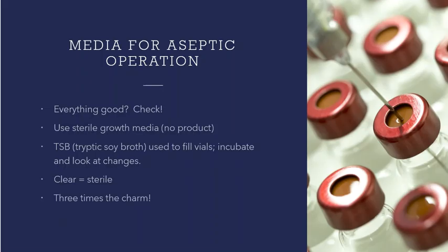So sterile growth media, and then we go in and we just swab everything and we put them in. We look at the results a couple of days later. And if they stay clear, if I don't see any colony growth at all, then this is great news for me, because that clears me out and I can say, listen, not only have we decontaminated, not only have we cleaned, but there's zero microbes because we've tested it. Here's proof in the pudding. So please open us up for production and we can start making product yet again. Very often they will do this more than once. So they will go through and they'll swab and incubate, swab and incubate, swab and incubate.